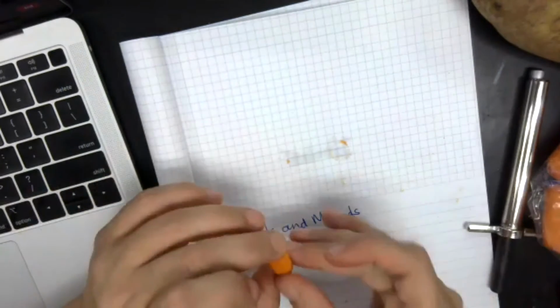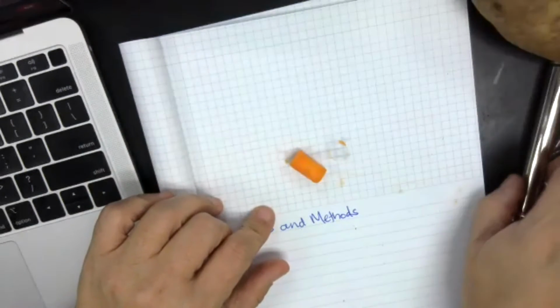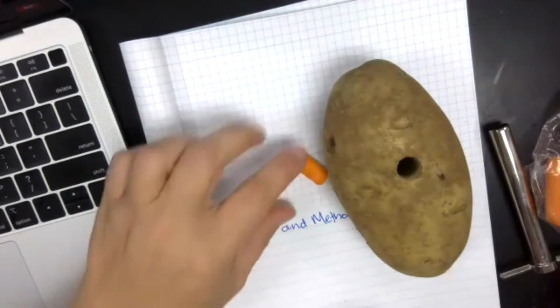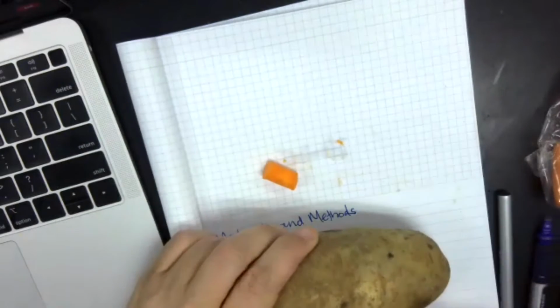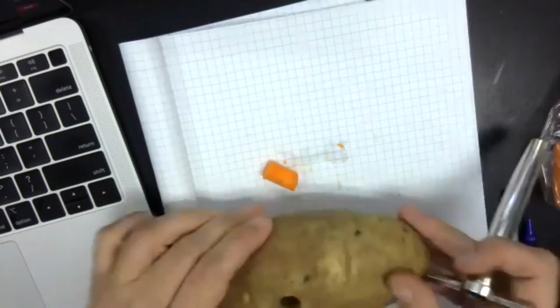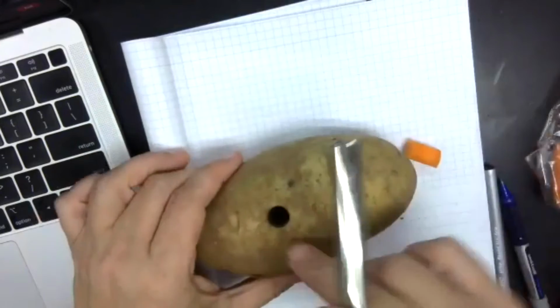And that's it. So then you're going to do the same for your potato. My suggestion is that you match as close as you can. You don't need a ruler or anything, but match the core from your potato as much as you can. So if you have a little vegetable here, you don't have to core through the middle. Some of these are already cored from yesterday.